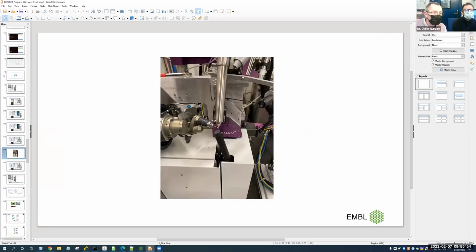So the great thing is that we can either have the cryostream in position here, or we can move the humidity control device in. So we can then match the relative humidity of the stream to the relative humidity that matches your crystal, and I'll come on to that in 1 second. It's a very easy calculation. Or you can start dehydration experiments.